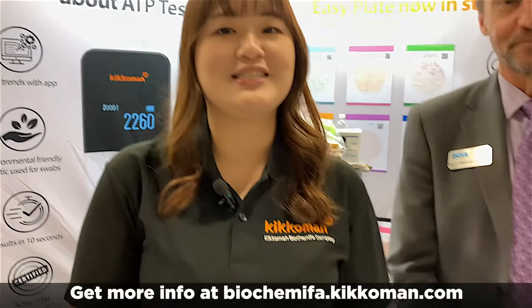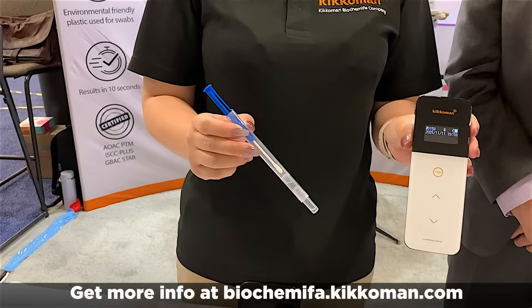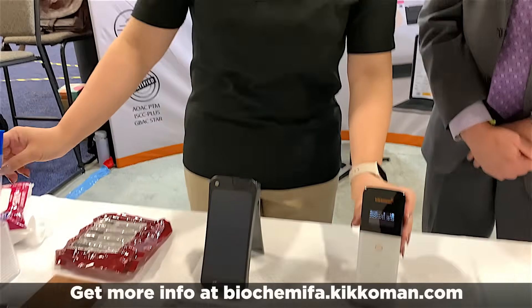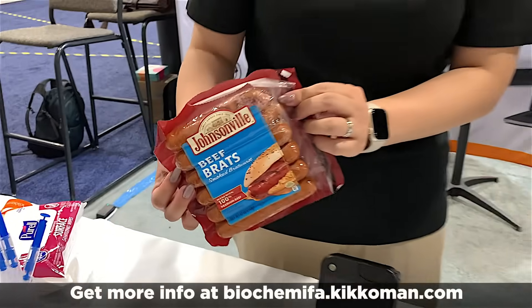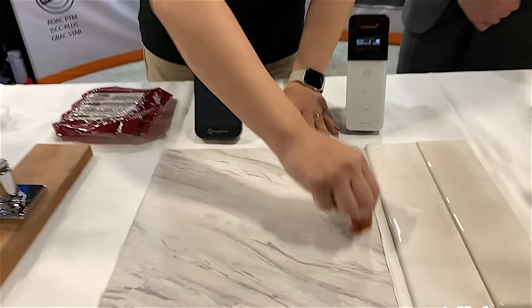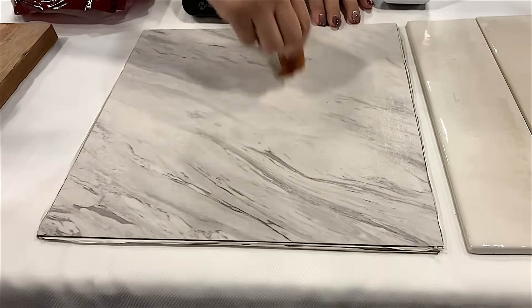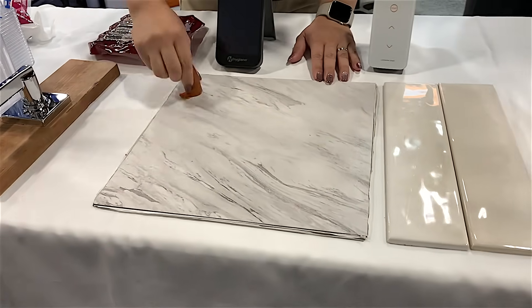So today, I'll be demonstrating our ATP meter, which is called the LumiTester Smart, and then we have the LuciPac swabs as well. So right now, first, this is a tile. I'll contaminate the surface with the Johnsonville sausage over here. Directions on the label say to thoroughly cook the sausages — they're great to eat, don't eat them raw. I'm just going to grab a sausage and contaminate the surface, make it really nice and greasy.